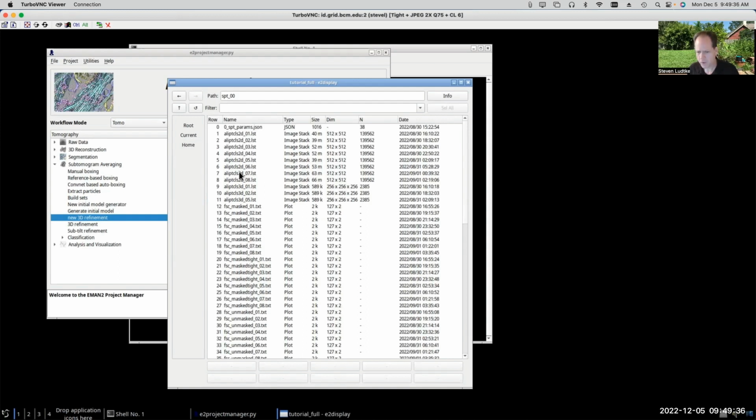So the Ali particles 2D exists for all of the iterations. So there are 2D alignment parameters present all the time. The 3D parameter is only present when it's doing a 3D alignment. So then the first two iterations of 2D were generated based on 3D alignment. Yeah, these should basically just be neutral. Shouldn't really be any alignments there. I mean, it might be previous alignments or something like that that got inherited.